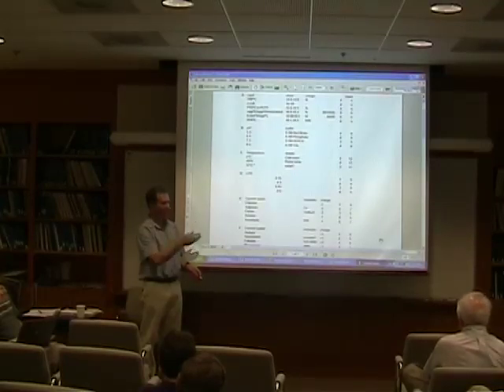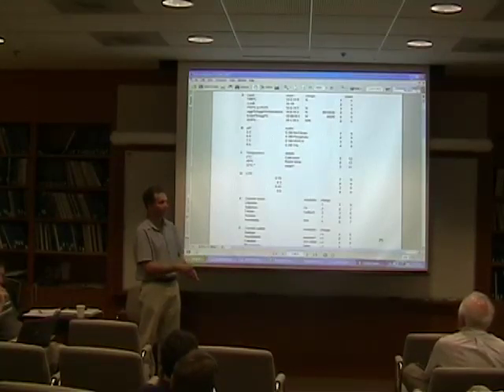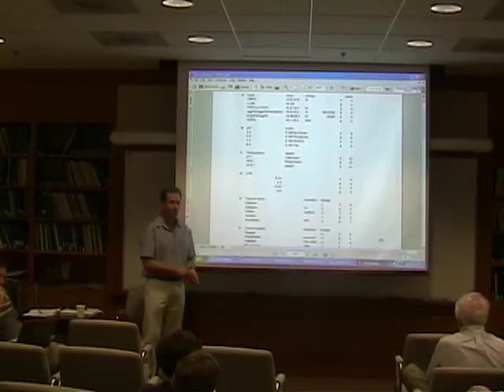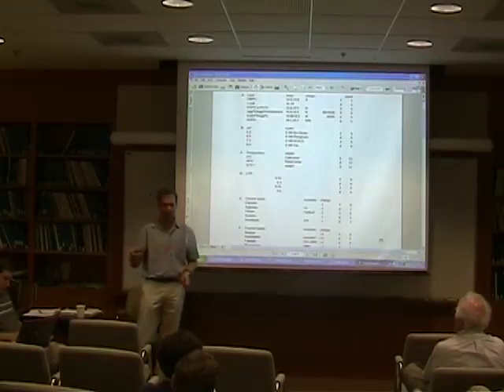So if you get a large vesicle which is highly protein packed, that's more valuable than a large vesicle that has low protein packing. I think that's very key in this approach, that you define the outcome, the good crystal, because the quality is really not good enough, you have to qualify good. Yeah, so that's what we've done, and I can maybe pull that up in a minute.